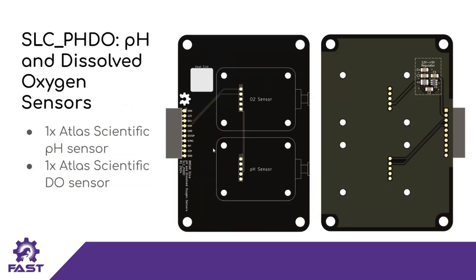This is a special slice: PHDO is a pH and dissolved oxygen sensor slice. You'll notice there's no Arduino on this slice, because we're using proprietary O2 and pH sensors from Atlas Scientific. They do their job really well and are quite expensive, but researchers might want to use them anyway. BREAD is a great framework for integrating I2C-enabled proprietary technology with an open source system.